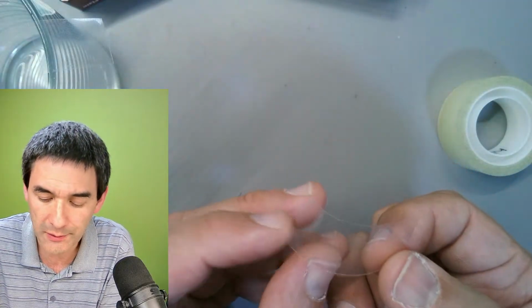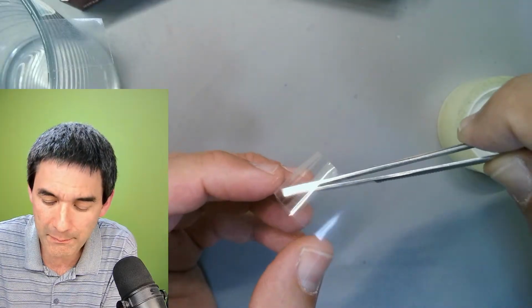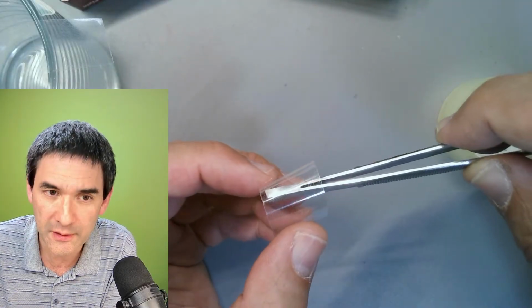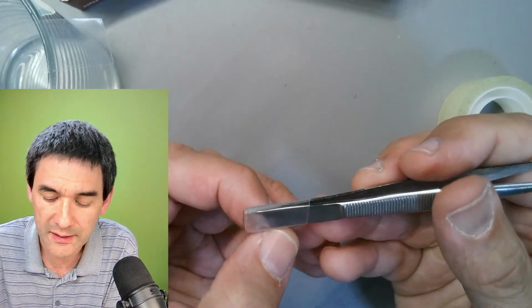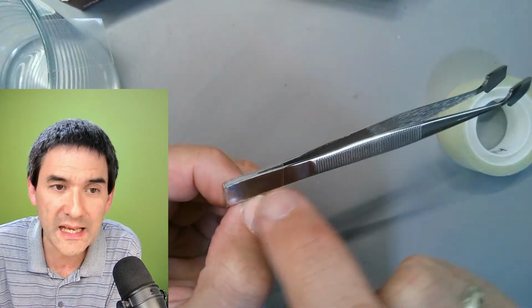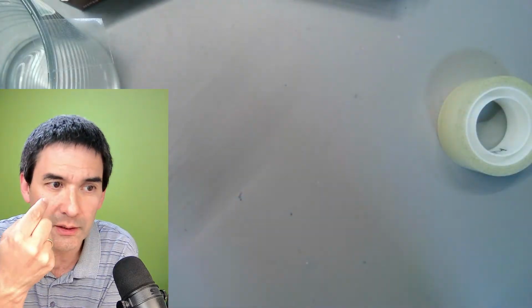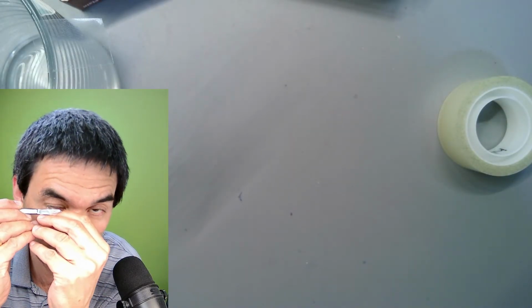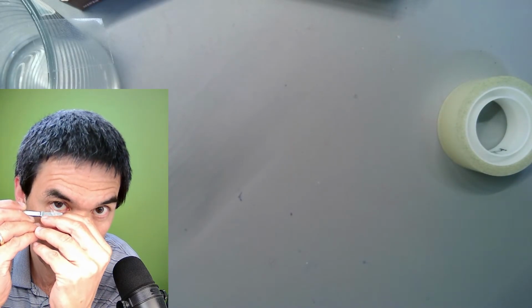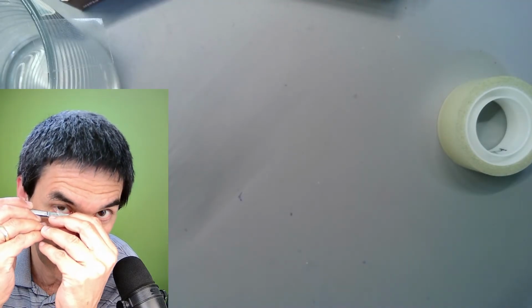You take the tape, sticky side on the outside, and you wrap it around a pencil, or I'm just using the back of my tweezers here, like this. Then you use this edge here, sticky side on the outside, and you have to look at what I'm doing right now. You touch and you try to collect, and don't do it too lightly.